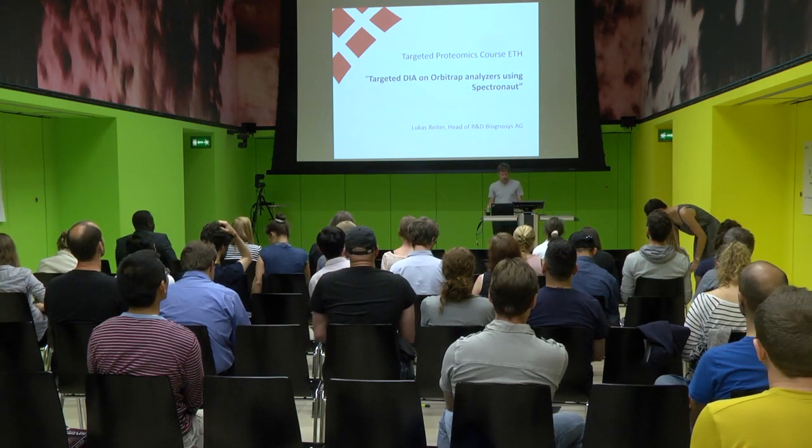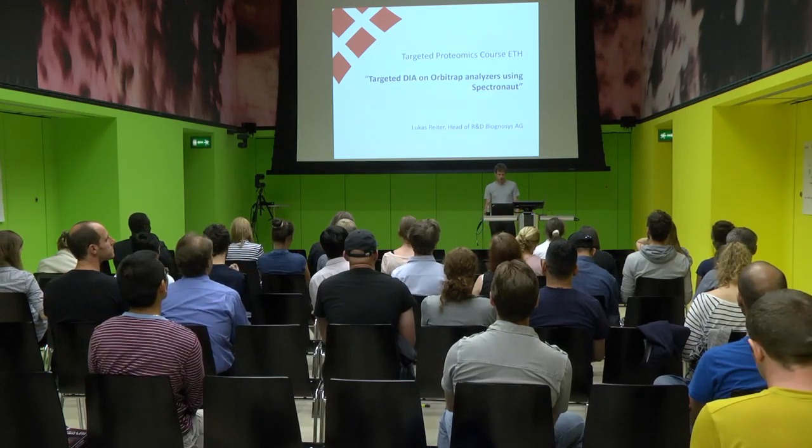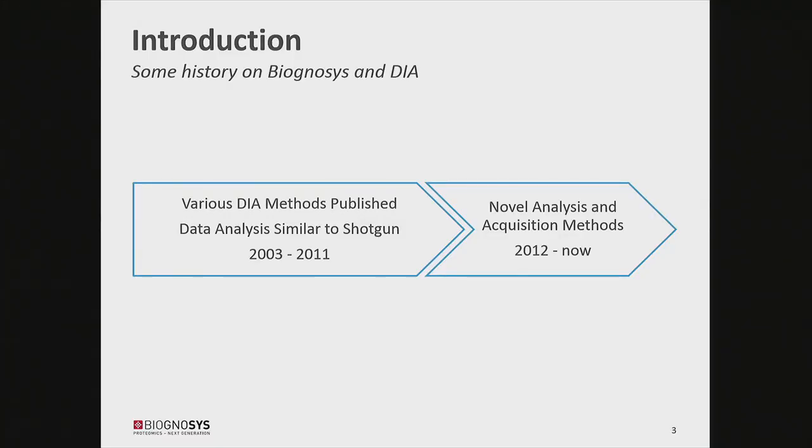The title is Targeted DIA on Orbitrap Analyzers using the software that we developed, Spectronaut. It's quite an open title, so I will take the liberty and discuss quite a lot of different things. First, an introduction. Maybe it's interesting for you: a quick history of DIA, data independent acquisition, how this all started for us and how we got involved in that.